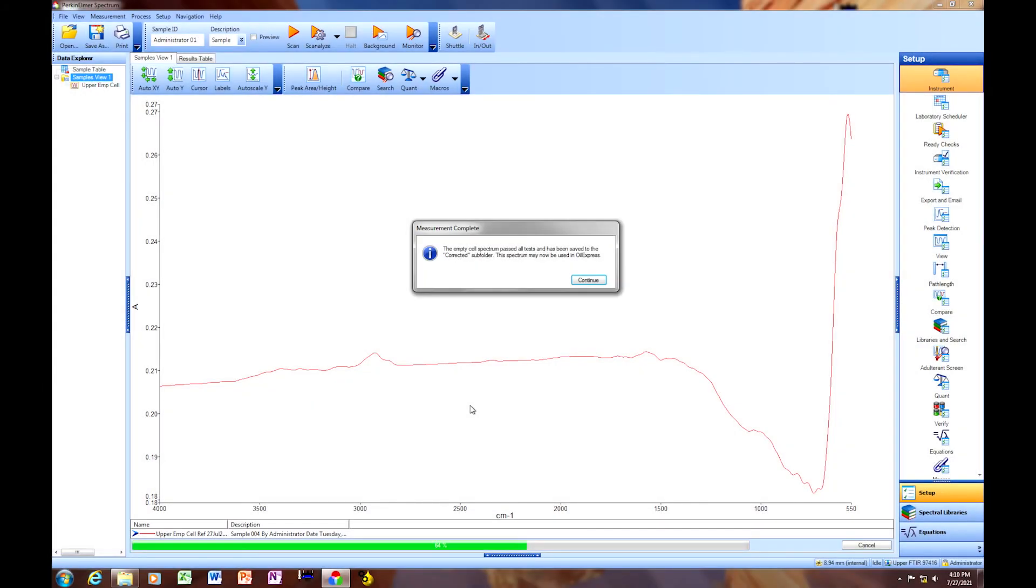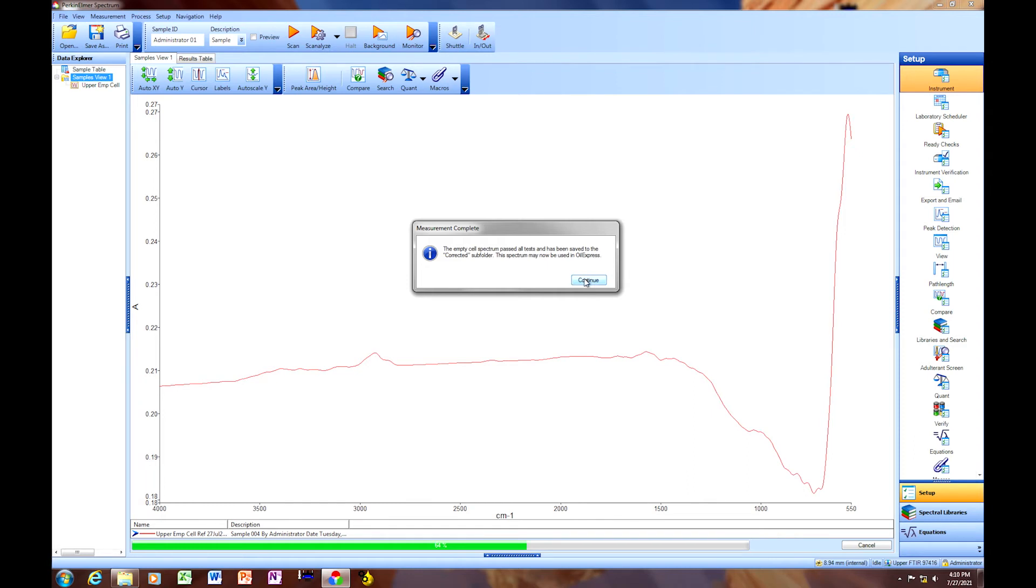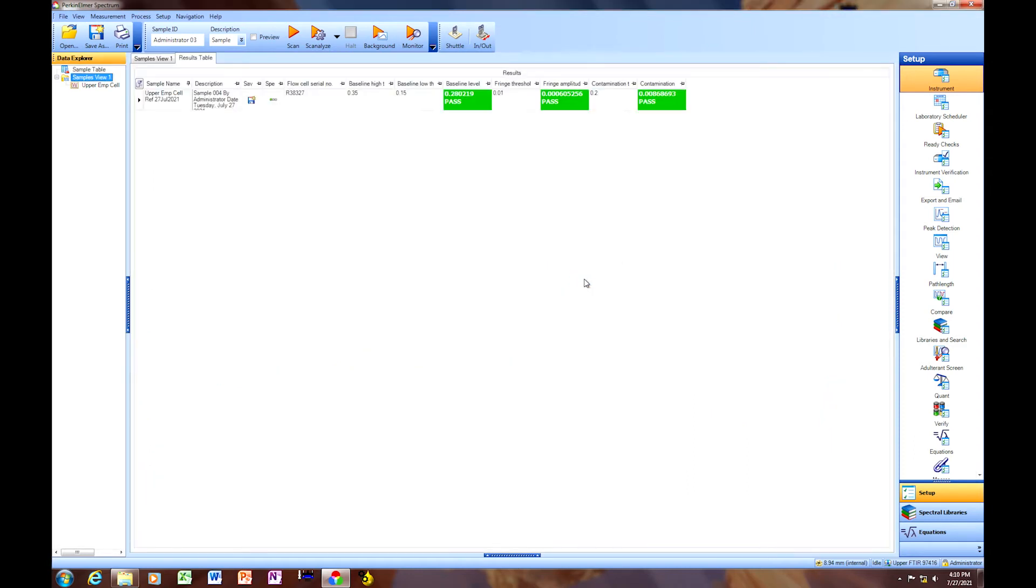So once it's finished with the empty cell collection, you will see that the corrected version is now on screen. And you can see there's a slight baseline shift, and smoothing has been applied. So we're going to click Continue, and it will tell you that our empty cell reference spectrum has passed.